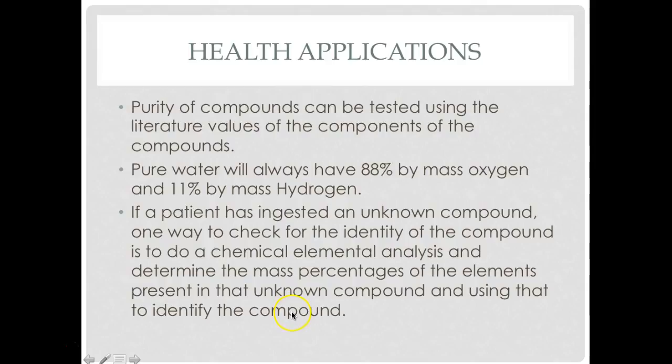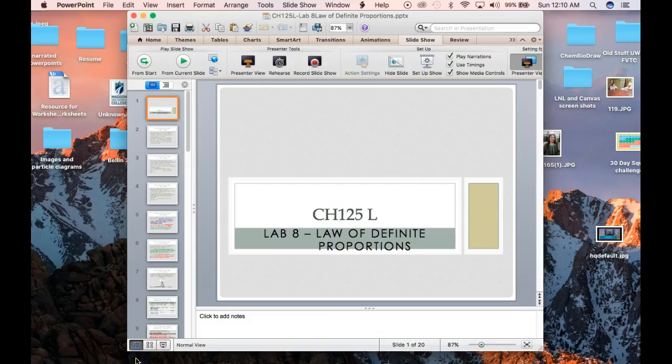Once you have the elemental analysis, that kind of confirms what your compound is, because you can go to the literature values and then compare. And that concludes this lab.